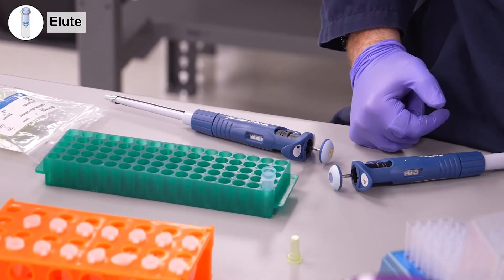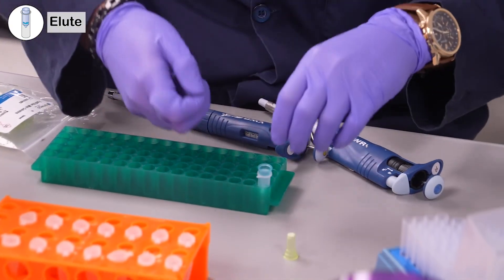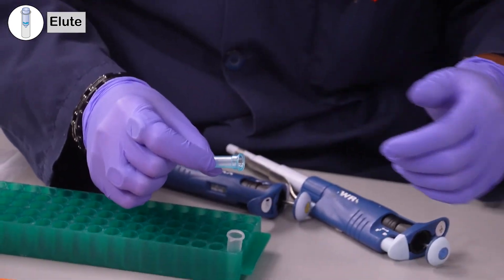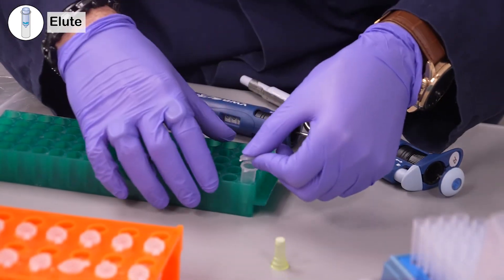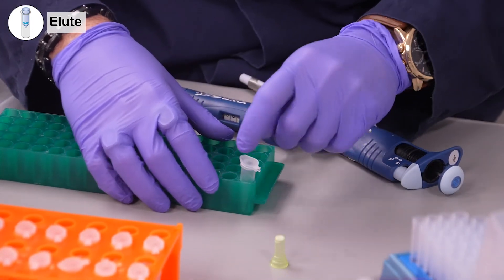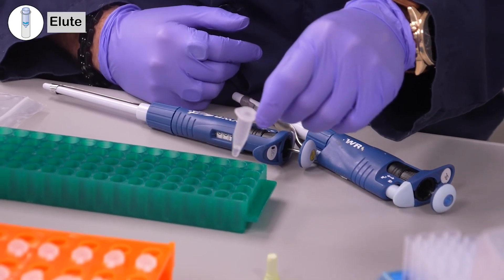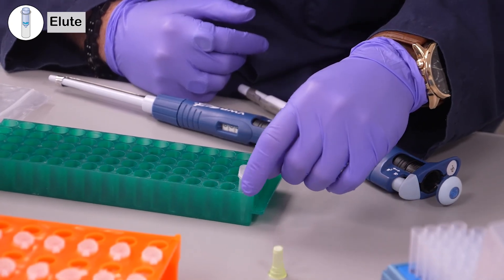Have your tube ready. At this point, you can discard the high bind mini column. Cap your tube and save it at minus 20 degrees or use it immediately. And that's the protocol.